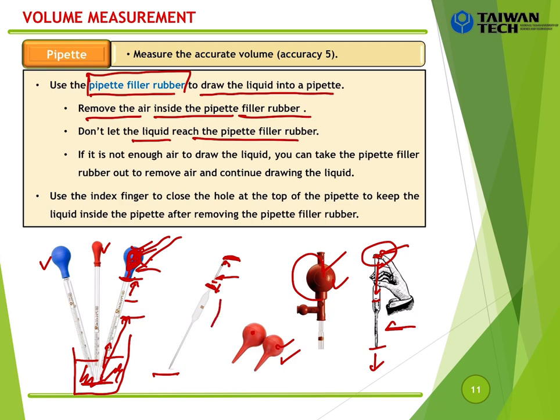And you know that inside the pipette here you have 100 milliliters. Similarly, if you have this one with only 5 milliliters, at the beginning it is here, and when you remove the filler and use the finger to keep the liquid level, maybe it can move until here, because you put the finger on not immediately, right? So maybe it goes down a little bit, and then you can let air come inside slowly, and control the liquid level until here. That means inside your pipette you have 5 milliliters already. So you have 5 milliliters or 100 milliliters, and then you can add this into the container.